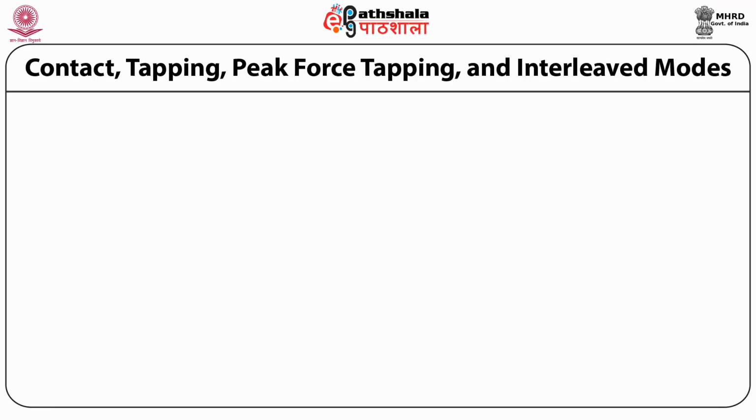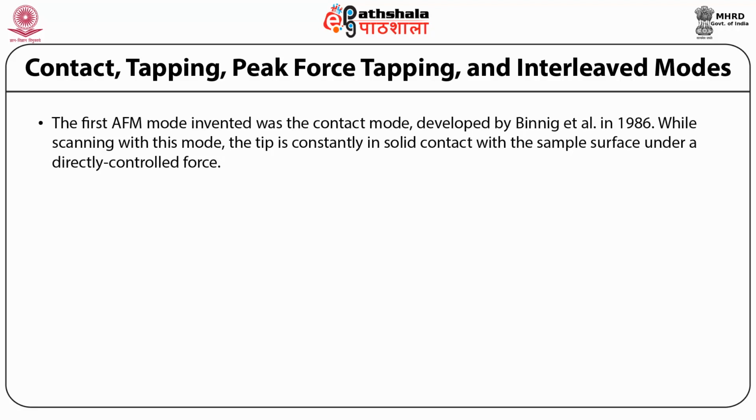Contact, tapping, peak force tapping, and interleaved modes have been described. The first AFM mode invented was the contact mode, developed by Binnig et al. in 1986, as we have already covered in the previous slide. While scanning with this mode, the tip is constantly in solid contact with the sample surface under a directly controlled force.